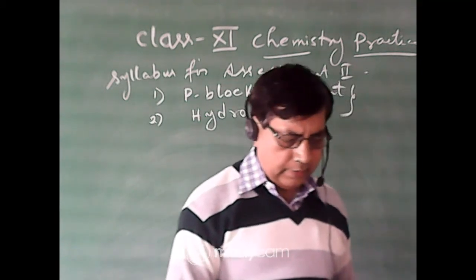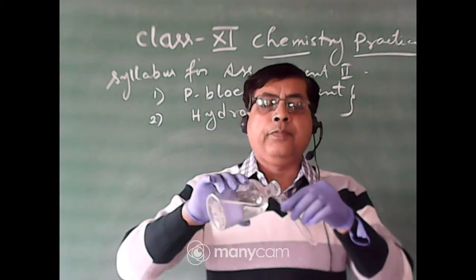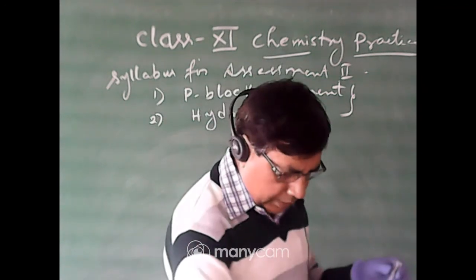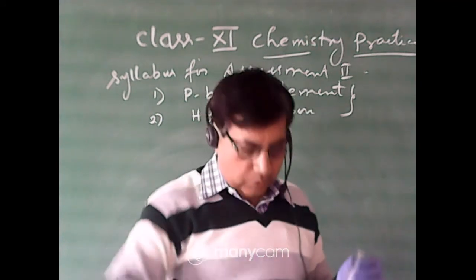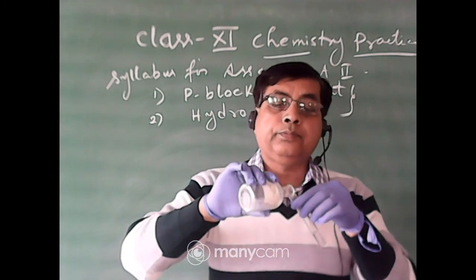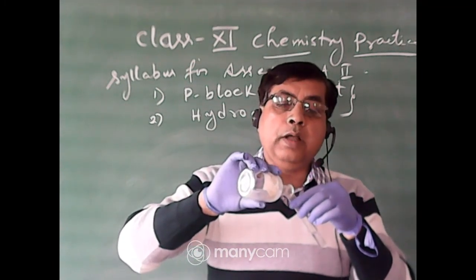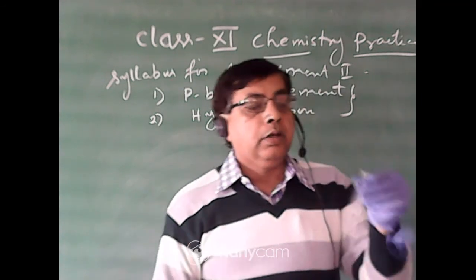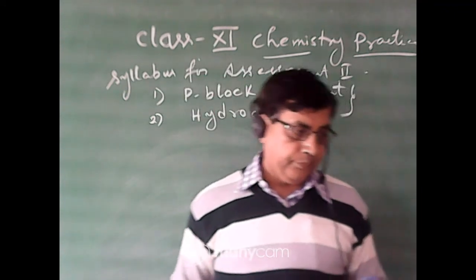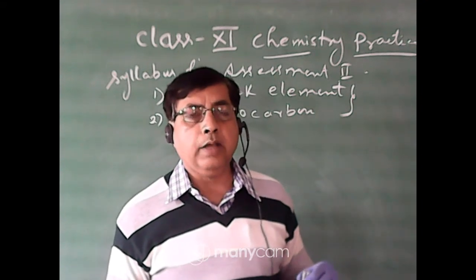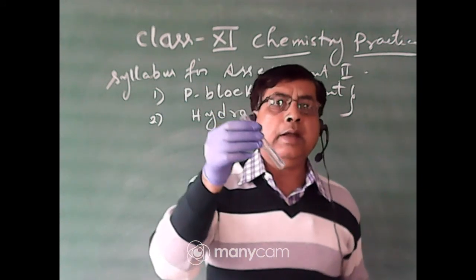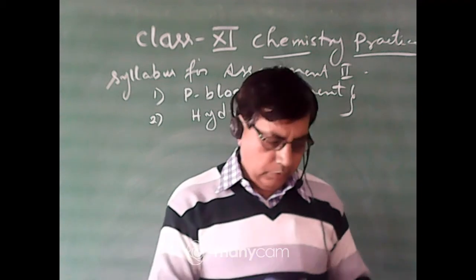Now perform the Group 3 test. The Group 3 reagent is ammonium chloride and ammonium hydroxide. First add ammonium chloride, then add a small amount of ammonium hydroxide — do not add excess ammonium hydroxide. No white PPT is formed here, which means Group 3 is absent.